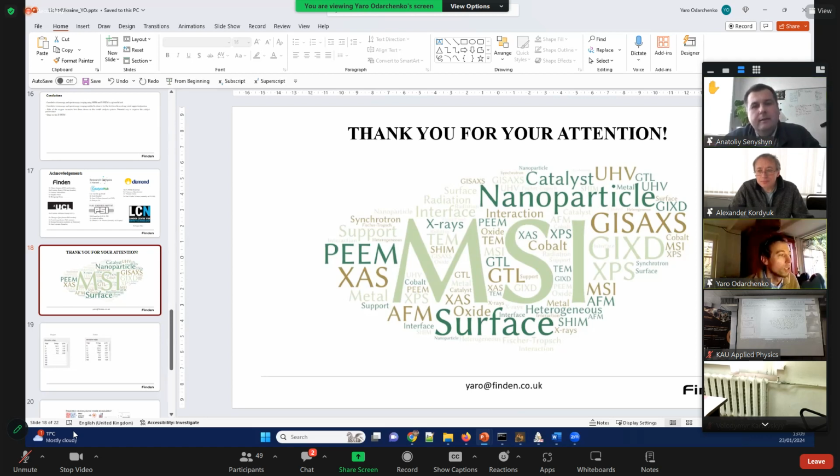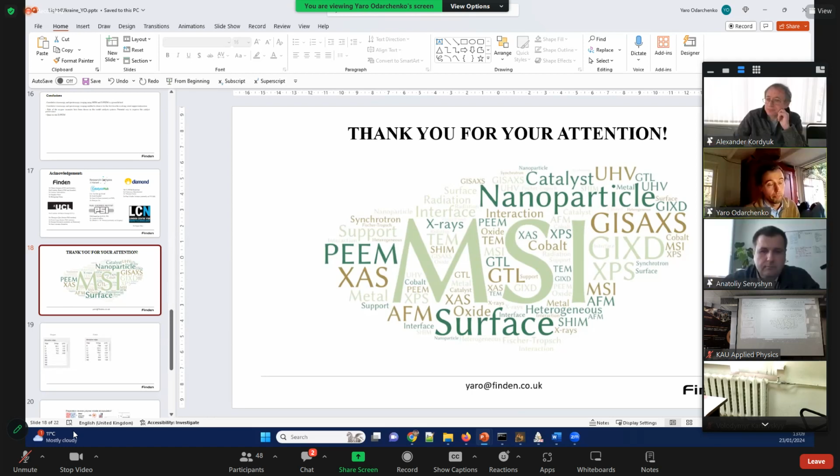Yes, thank you, Anatoly. It's absolutely right. Our main business is so-called XRD CT, X-ray diffraction computed tomography, and we're using energies of around 100 kV to penetrate quite thick material systems, real systems, for example batteries.